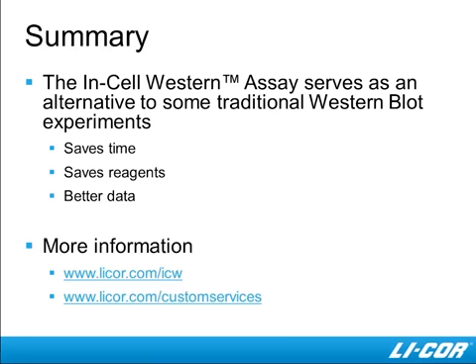What I would recommend is, if you do have a primary antibody that's nonspecific, that you optimize the primary antibody conditions to decrease the level of nonspecificity. This can be achieved with blocking conditions, detergent conditions, and I would encourage you to work with your local field application scientist, and they can help you also to increase the specificity of your primary antibody.